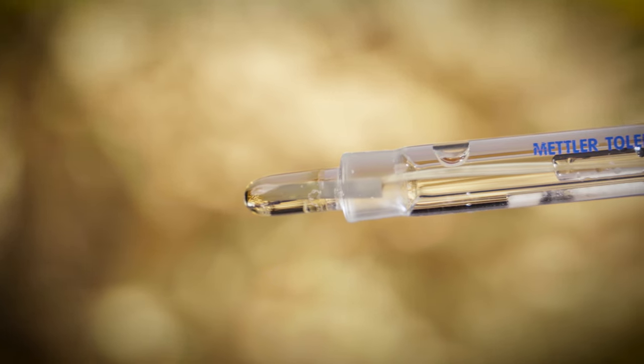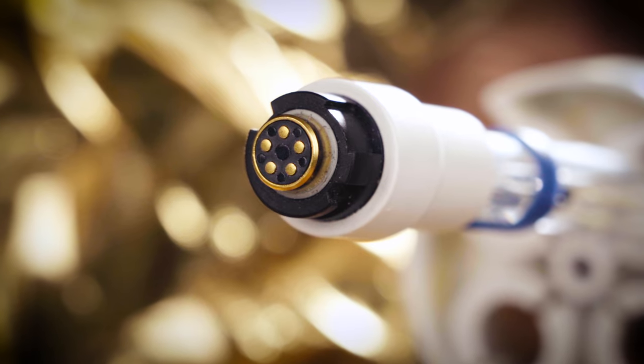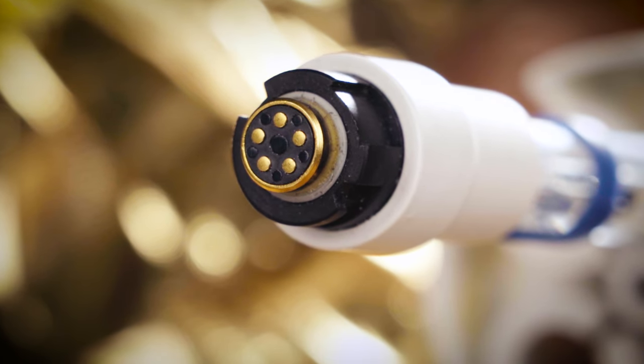So, if you're tired of getting inconsistent readings for cathode slurry samples and feeling like you're playing a guessing game, it's time to upgrade to the Mettler Toledo InLab Max Pro ISM. Reliable and accurate results every time. Thanks for tuning in and happy measuring.